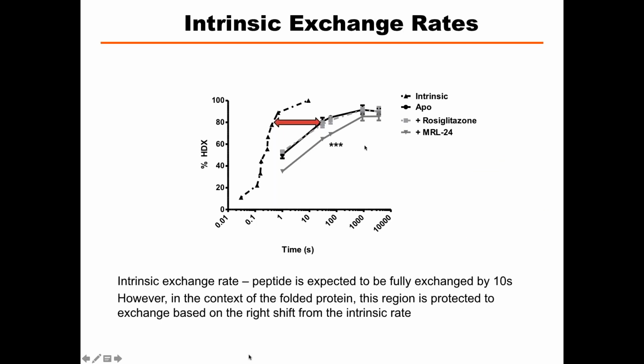Yes, that's calculated based on Walter's NMR data. You put in the sequence, pH, and temperature. It's the primary sequence, so it's assuming random coil. If that sequence had no structure, that would be its intrinsic exchange rate. So each dipeptide is slightly different, and it depends on the pH at which you're doing the experiment and the temperature, minus prolines and minus the two N-terminal residues.